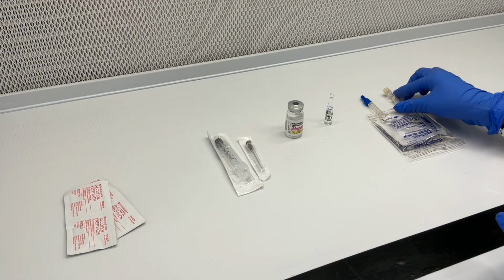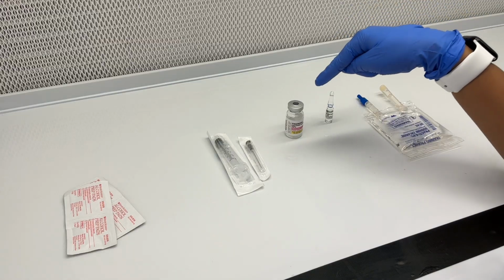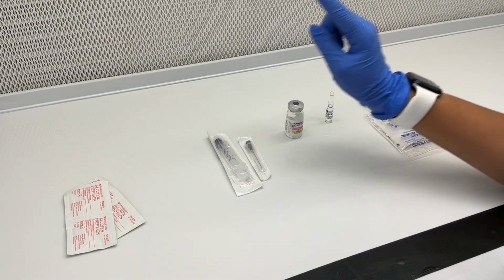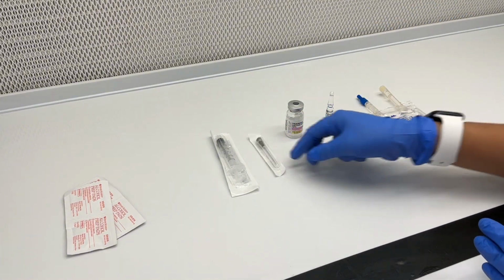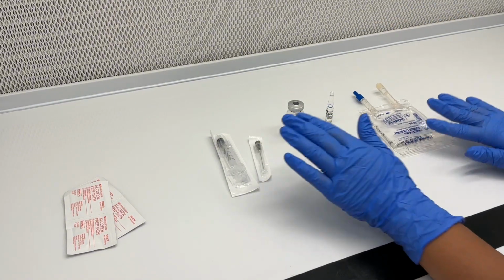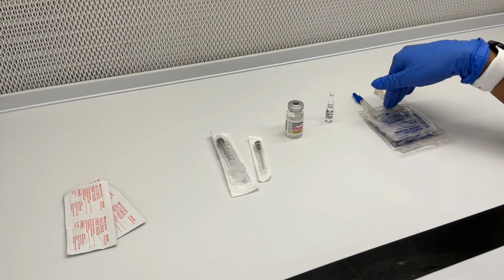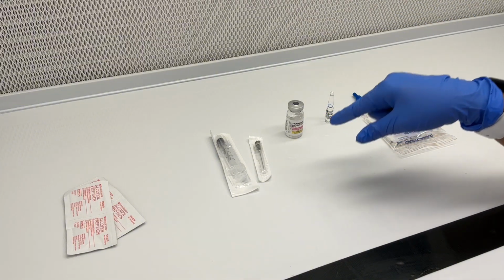So your critical sites being your injection port, the neck of your ampule, your injection site on the top of your vial, your plunger, your hub of your needle, as well as your entire needle besides the cap. So everything in here is placed in first air. You have your airflow hitting the injection port directly, hitting the neck directly, hitting your injection site directly.